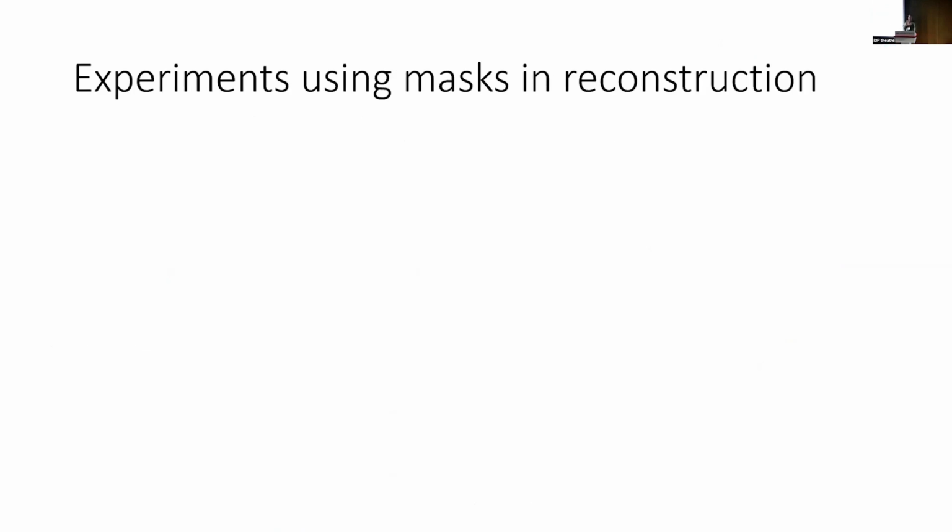All right, so now the next part of the talk, having these different types of bases, I want to see, first of all, how can we use these in a reconstruction? What are the different options for us in terms of utilizing them to get a good reconstruction? And the focus here is on adaptation. So we don't fix the basis at the beginning, or we might fix it at the beginning, but that's probably not the best way of going about it. We want to adapt the basis somehow.